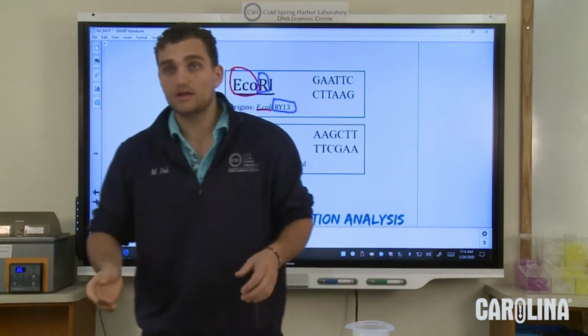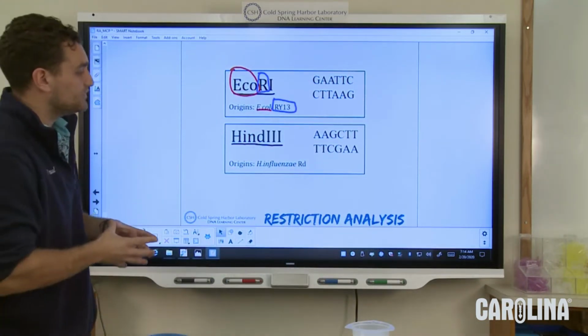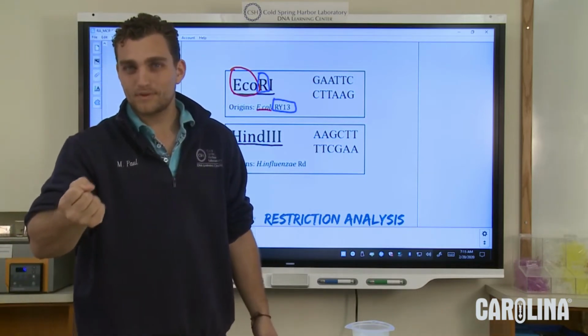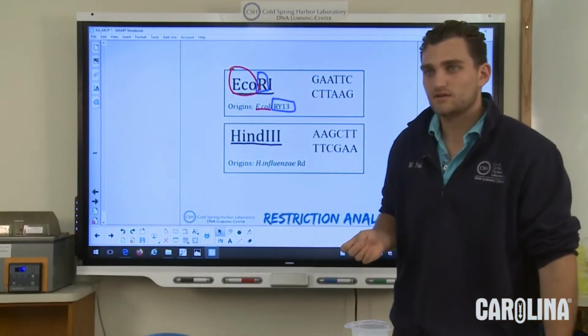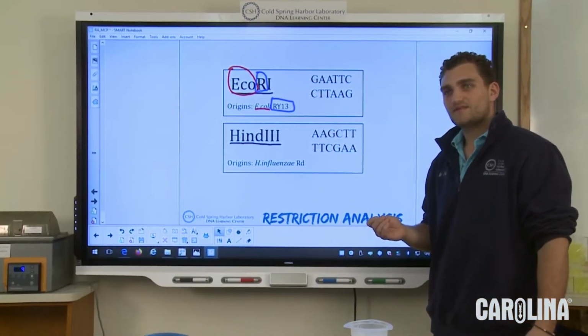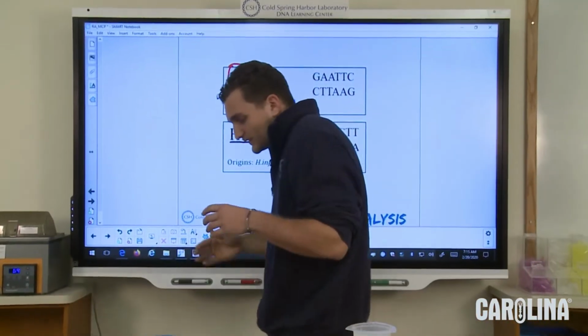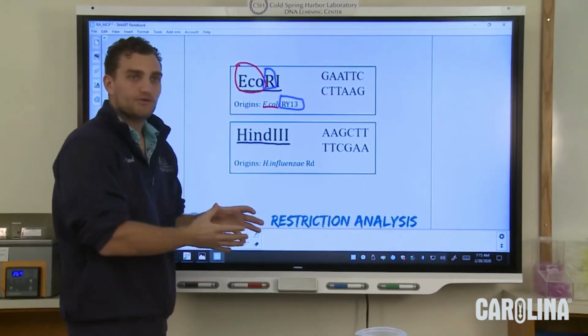Now HindIII, Hind because it was in the H. influenzae bacteria, D because it was the Rd strain, and 3 because it was the, what do you think? The first one, the second one, the third one, the fourth one found? Which one do you think HindIII was? Third one, exactly, thank you. It was the third one found. So the name of these enzymes will tell you a little bit about those enzymes.